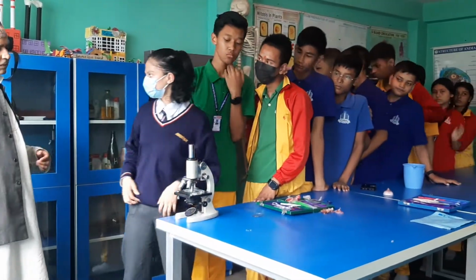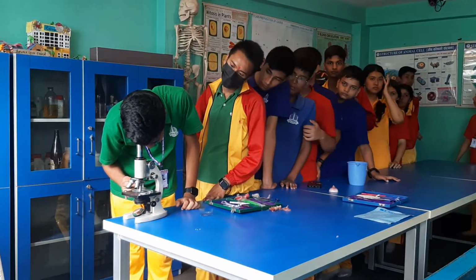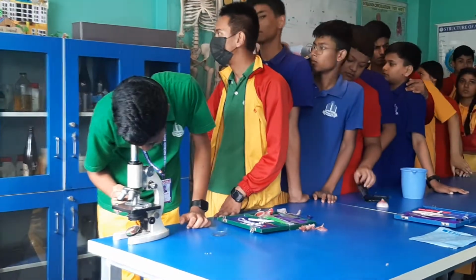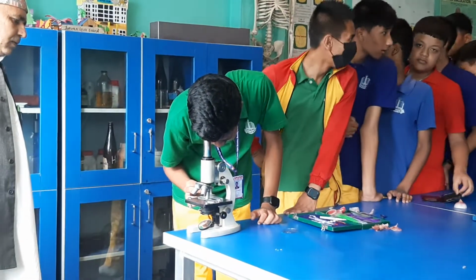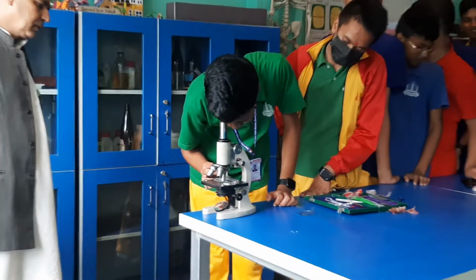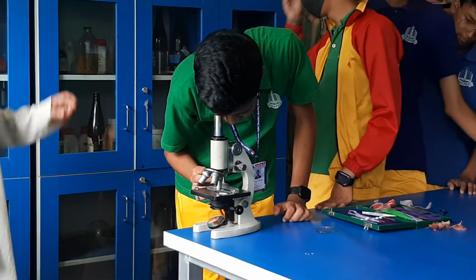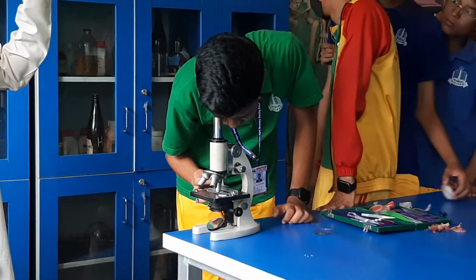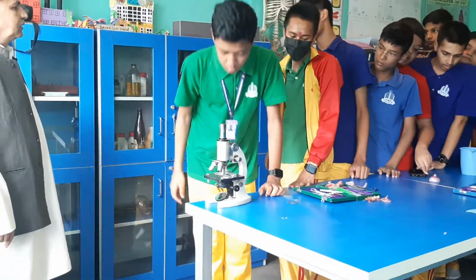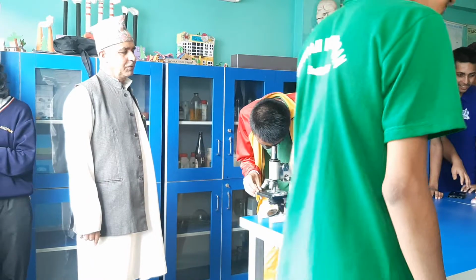Done? Okay. Simply you have to move left, otherwise right. More right. Can you see the black thing is small? Earlier the rooms were a bit small, now they are big, right? Okay, those are the cells. Now slowly you can do it. Don't be in a hurry.